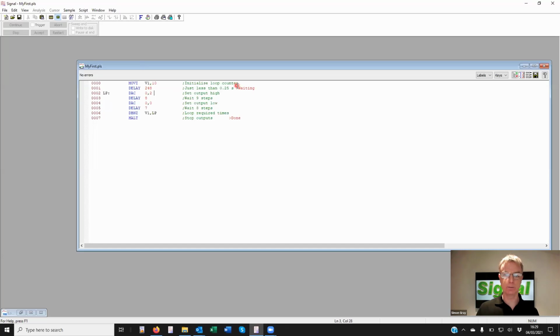We've also got this sort of greater than sign on the end of the comment with a bit of text after that. When you're executing the sequence, the control bar for the sequence will appear up at the top of the screen, and that will have text in it, which is the text that you're given here, so that the person using the program knows what the sequence is doing. It gives you a few clues as to what you need to do.